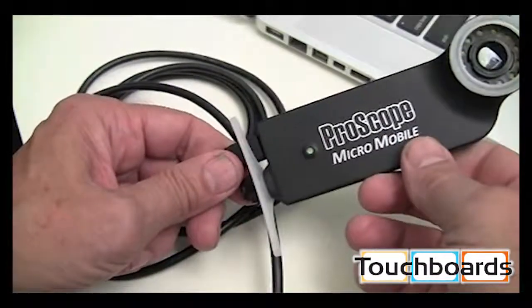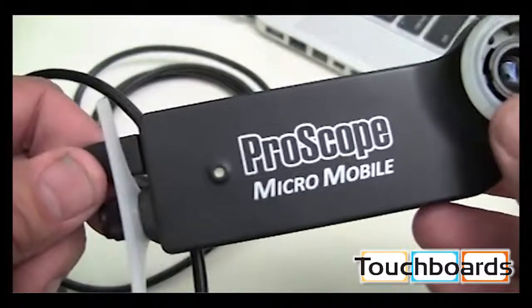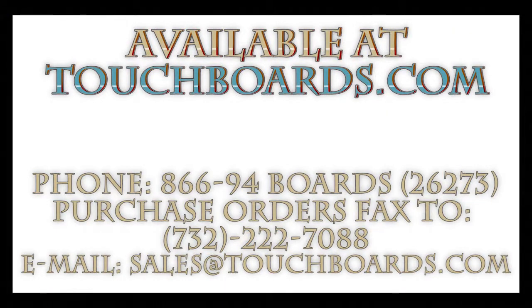The power indicator light will begin to pulse and when fully charged will remain solid green.